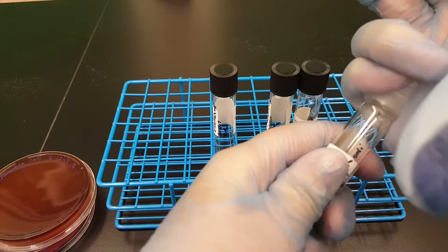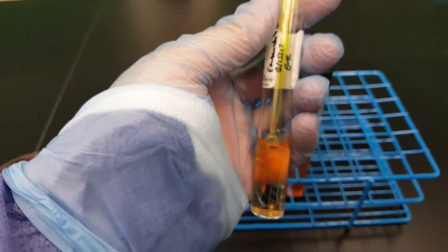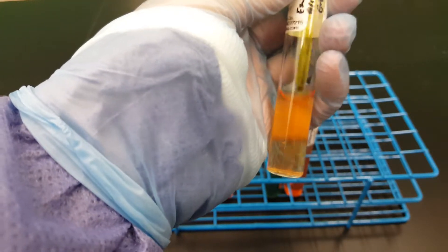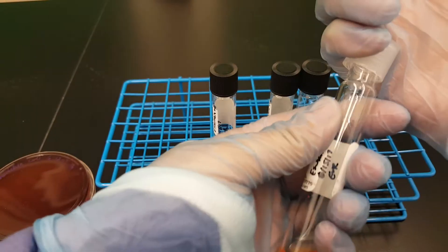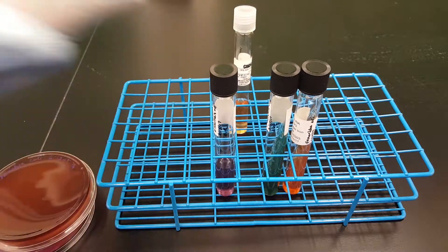The first one I'm going to do is the urease broth because I got organism on my loop. You don't want to touch the sides of the bottle. You're just going to put it in there, swirl it around. Pull it out, throw it away, put it back on from your pinky, and make sure that you turn it a half a turn back so that you don't kill your organism.